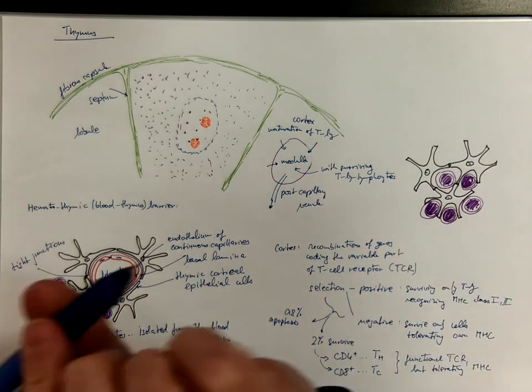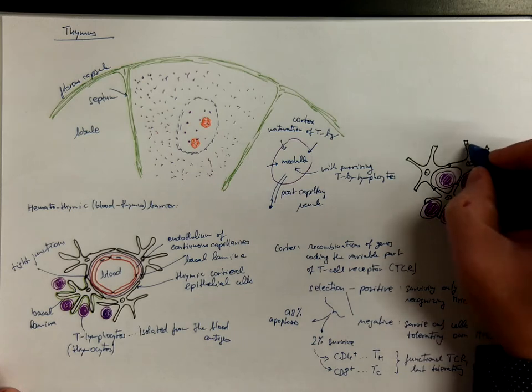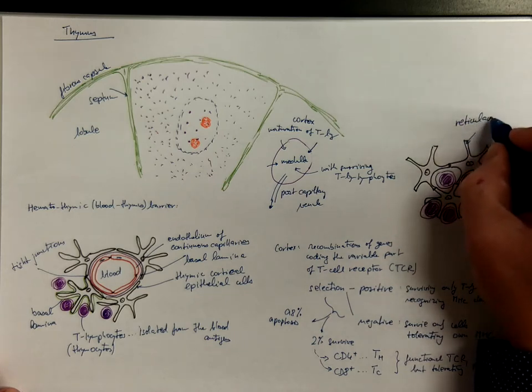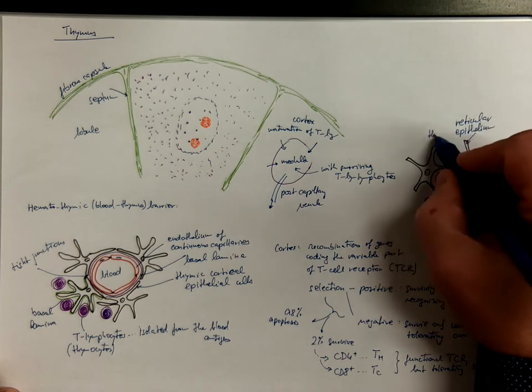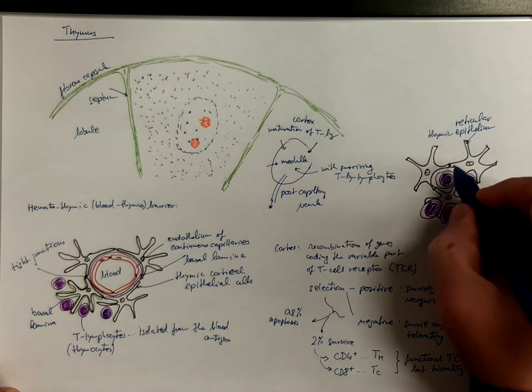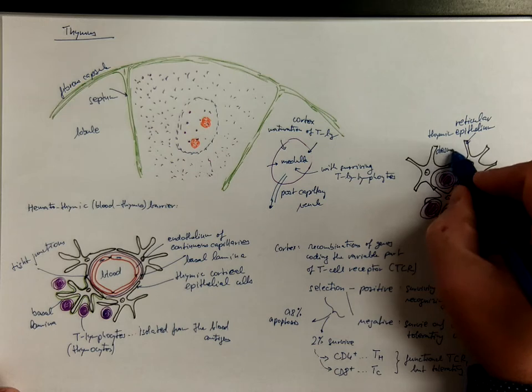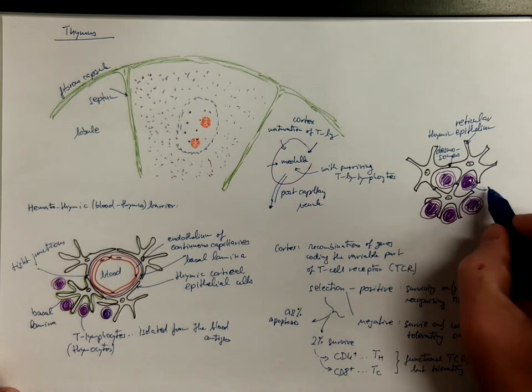These are reticular epithelial cells, thymic epithelium. Here we got desmosomes. The cells have tons of filaments maintaining the shape. Here we have the T lymphocytes.